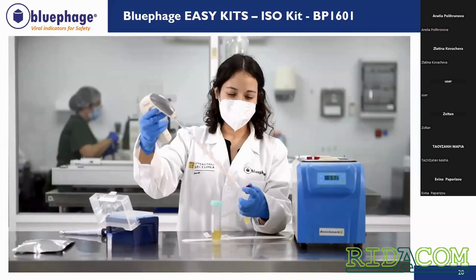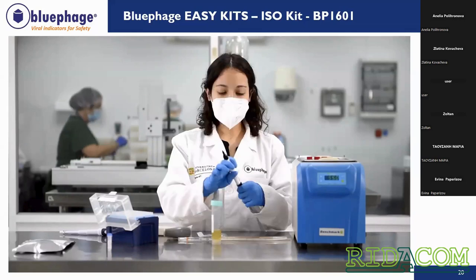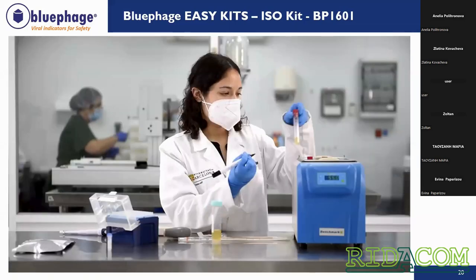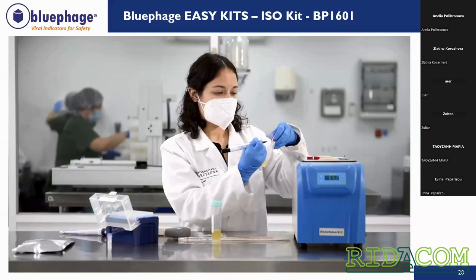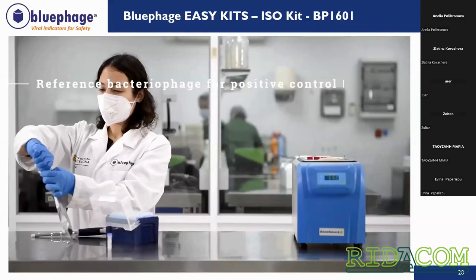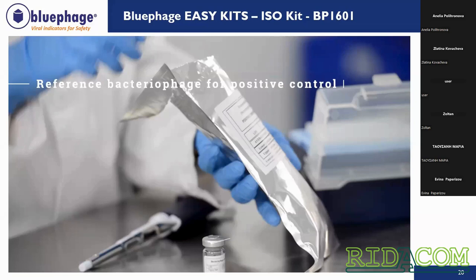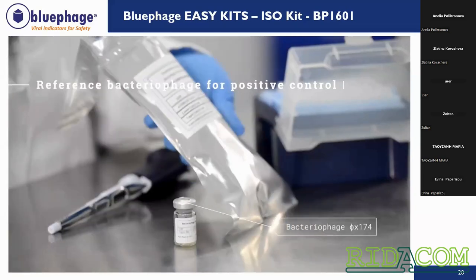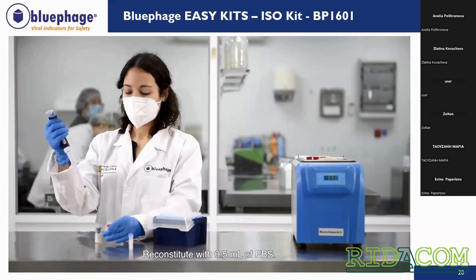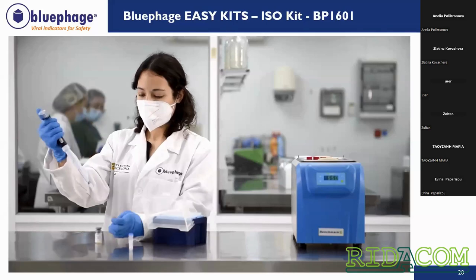So meanwhile, we have our test tubes in our water bath. We will prepare our samples. So in order to prepare our samples, first we need to prepare our positive control. So in our metallic bag, we have a vial with a lyophilized PhiX 174 and the vial with the PBS. In order to reconstitute our lyophilized positive control, we will add 0.5 mils of PBS in a vial.